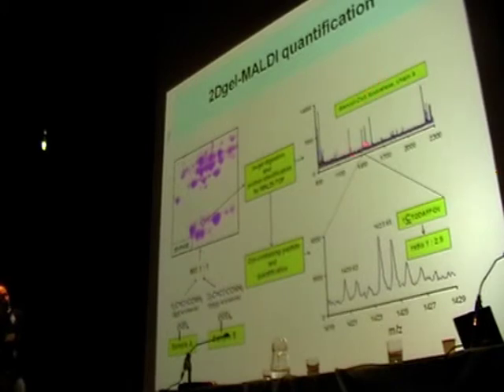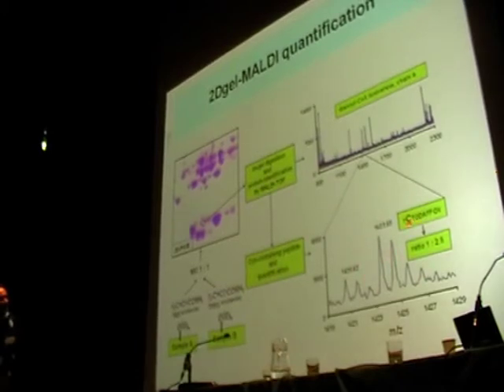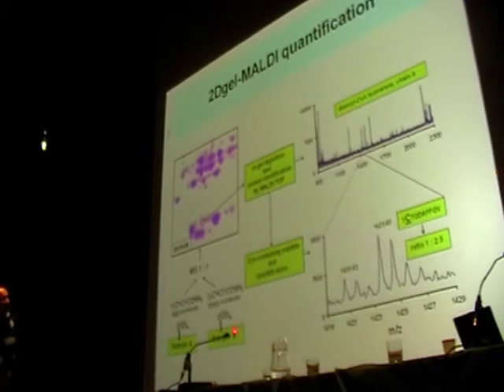And then we zoom into the spectrum and search for cysteine-containing peptides. What happens is that every one of these peptides is represented by 2 isotopic envelopes shifted by 3 units, because the difference between these compounds is 3 units of molecular mass. You see here, this isotopic envelope represents this cysteine-containing peptide from this protein from sample A, and this isotopic envelope, shifted 3 units, represents this peptide, which came from this protein from sample B.